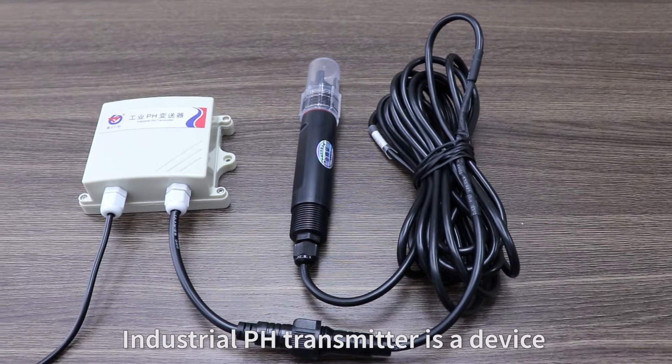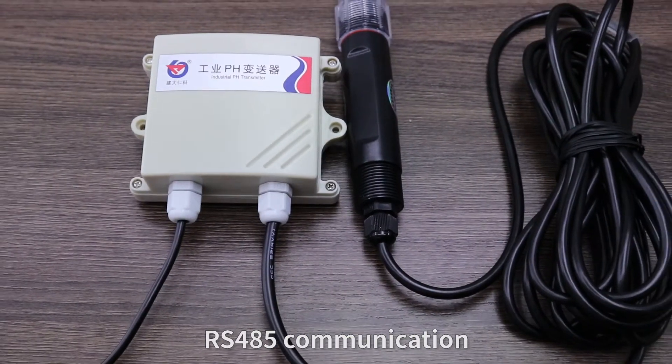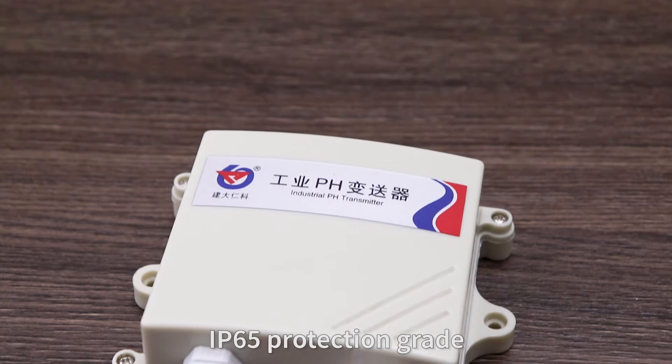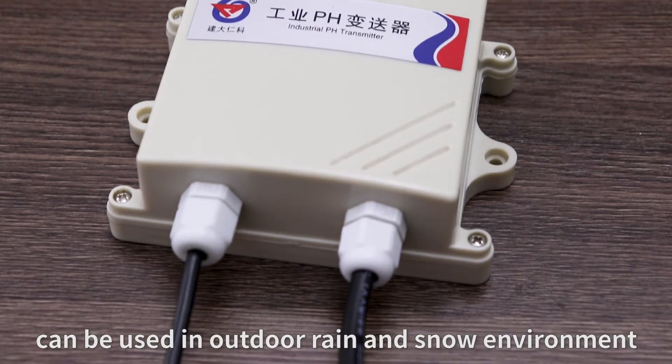An industrial pH transmitter is a device for measuring the pH value of a solution. It features RS-485 communication, making it convenient to connect to a computer for monitoring. With an IP65 protection grade, it can be used in outdoor rain and snow environments.